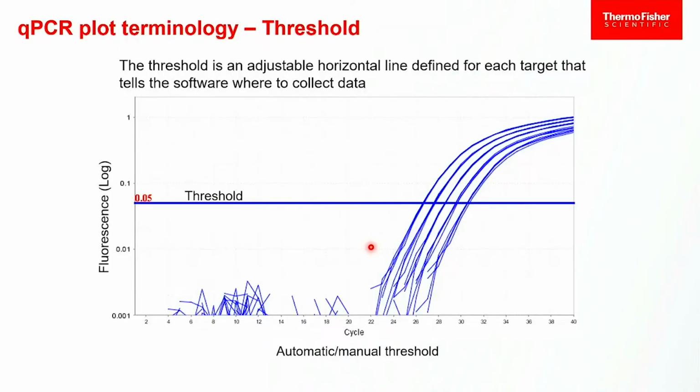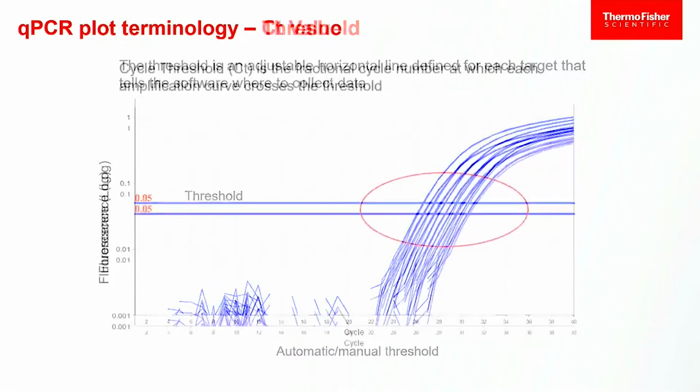Yes, it's one reaction tube. Typically, when we run gene expression, we want to have 3 runs of exactly the same thing. That allows us to do some averaging and outlier elimination. If you think maybe one of them is bad, you can throw it out and you still have good data. Or you have an average, which means you get error bars. Error bars are great. People shy away from them, but they give statistical confidence.